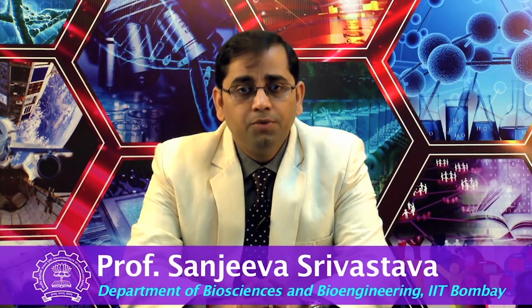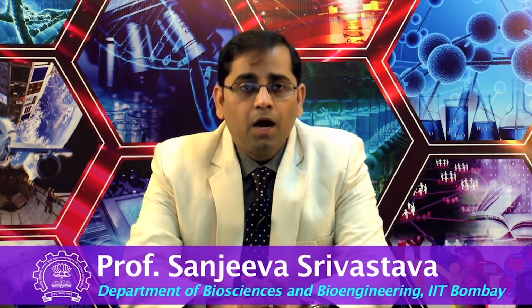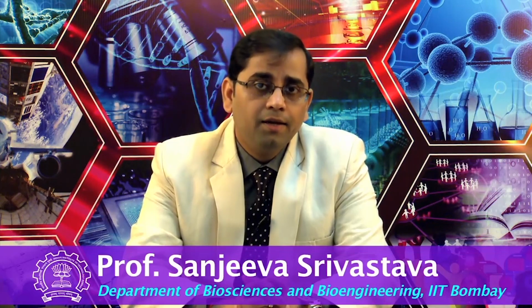I hope in this lecture you have learnt about inkjet printing and its benefits. You are also taught about different kind of substrates which are used for this printing and advantage of this technology over other technologies. In the next lecture, Dr. Saloni will continue and talk to you about how exactly this technology works and how it can be used for many microarray based applications. Thank you.